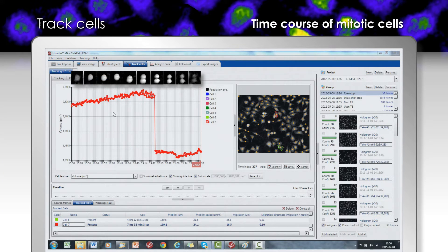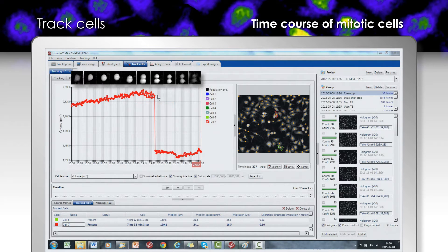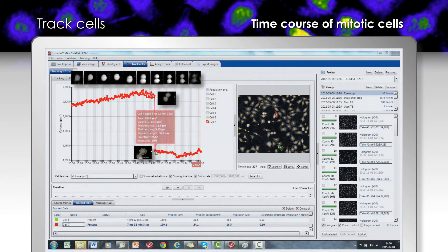As an example, mitosis and cytokinesis are robustly measured by HoloMonitor M4 in a label-free manner, with results comparable to traditional fluorescence imaging instruments. When cells proceed through cell division, the morphology changes from flat to round, with a corresponding increase in optical cell thickness and optical volume. Then the nucleus splits in half and the cell divides into two new daughter cells. The segmentation algorithm recognizes the daughter cells as individual events based on the sharp decrease in optical volume, enabling computer-assisted tracking of mitotic cells.